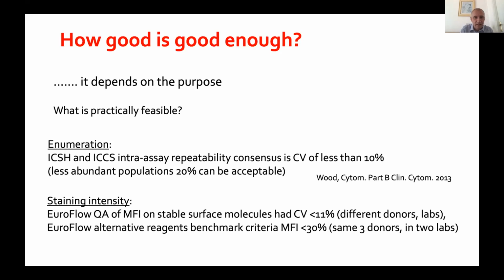So it's still relatively good, but the variability is influenced by the target epitopes and target molecules, but also by the reagents. So these two play together, and we have to realize which is contributing more to the spread of the measured data. Is it the biology or is it the reagents that we use?